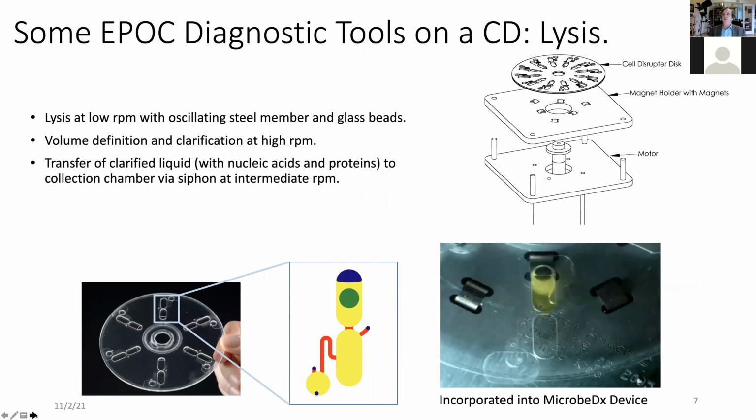So, okay, what have we done so far? We talked about the instrument, we talked about the disposable, we talked about extreme point of care. And as I told you before, talking about this major application we're going to run today, I want to tell you first how this whole thing operates, how this CD machine works.